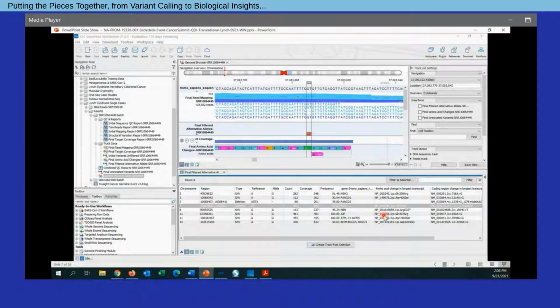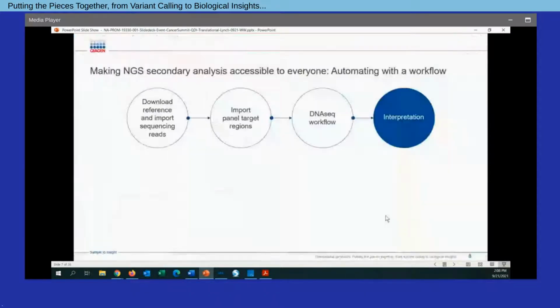and easily get to accurate variant calls, in this case for germline samples, or also in the context of cancer research, if you're working with somatic samples as well, get to those variants of relevance in your samples very easily. Now, to do this, we're going to do a couple of key steps within the software itself. The first one being to download reference information and import our sequencing reads. Now, again, this can be in the context of, as we're going to do today, utilizing public data, or conversely, if you have your own sequencing data, importing that as well.